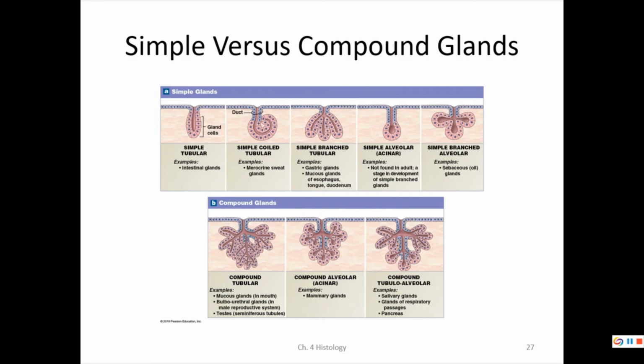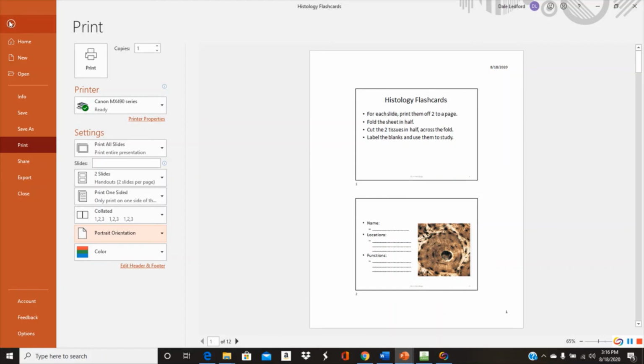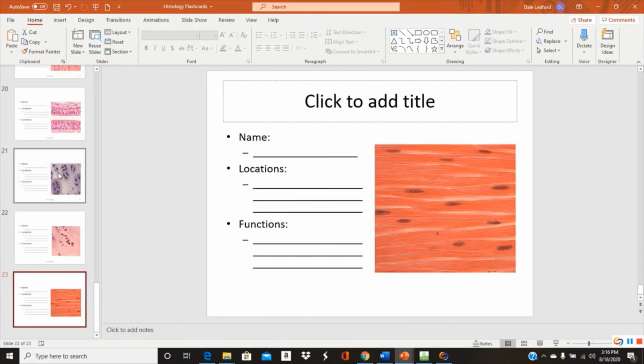Now, remember the pictures of epithelia, you're going to be looking at those. And if you printed out the instructions I told you to use, you can help identify everything, guys.